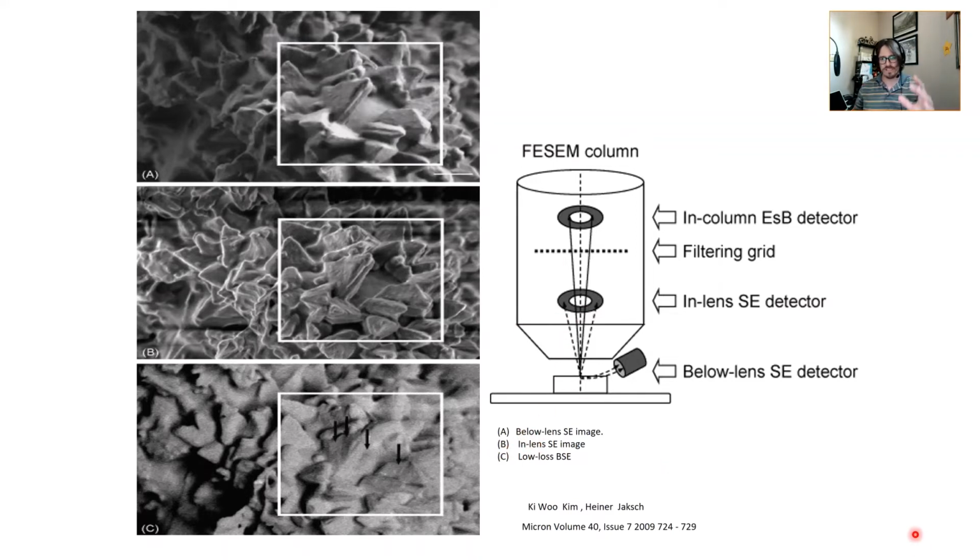Again, their premise is that the chamber of the SEM is like a fireplace, and that most of the signal goes through the chimney, just like most of the heat in a fireplace goes through the chimney. So that's a lot of the principle behind Zeiss design. And here's a below lens SE detector, and if you notice, they're kind of depicting it at an angle, and this is analogous to what Hitachi has for their below lens secondary electron detector.